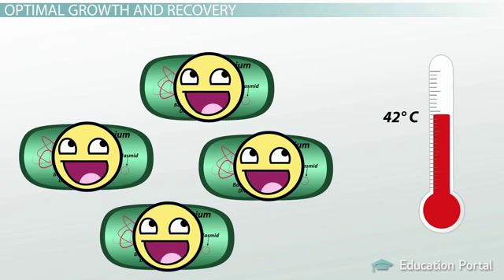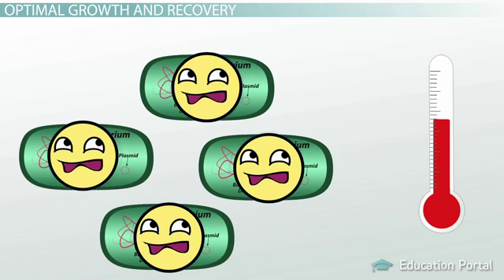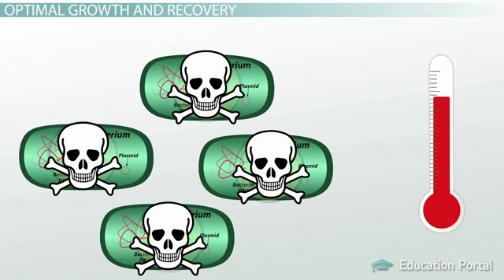Remember that we're dealing with living cells. And recall that E. coli naturally occur in our gut. That means that optimal growth temperature for them is human body temperature, or 37 degrees Celsius. Higher heat shock temperatures or longer heat shocks simply kill the E. coli.